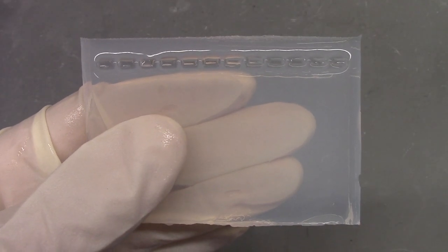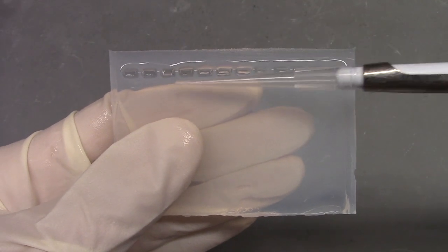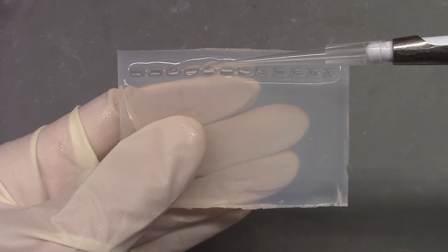Now, I need to get the DNA in this gel somehow, and to do that, I'll put the DNA in this well, which is a little hole that I made when I made the gel.